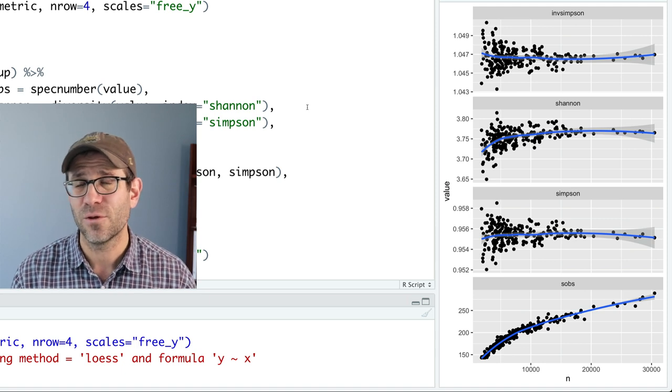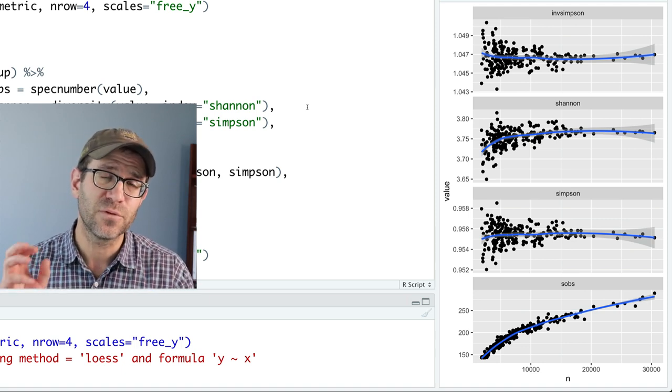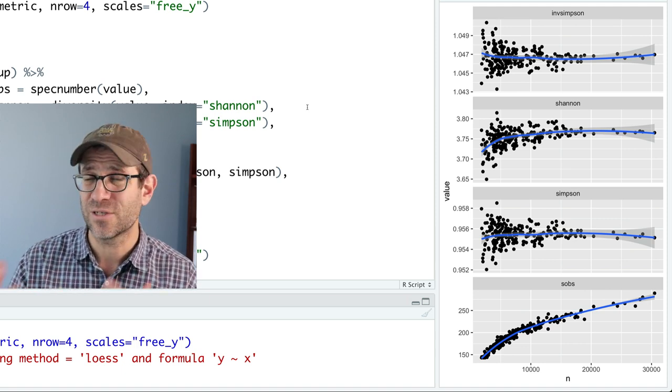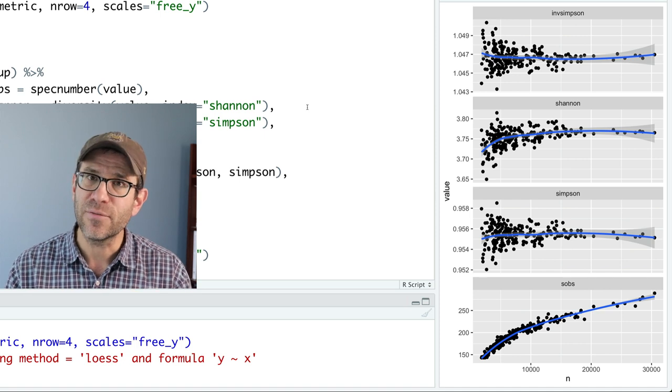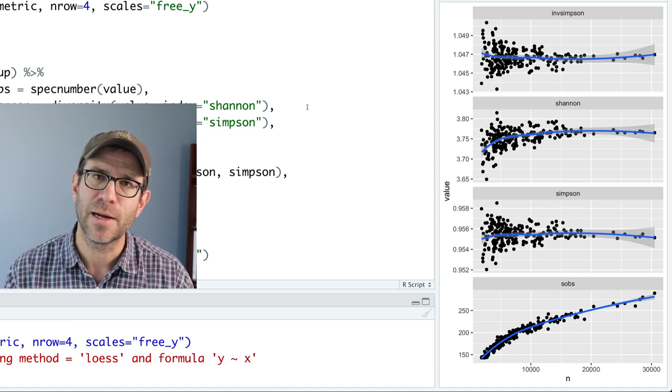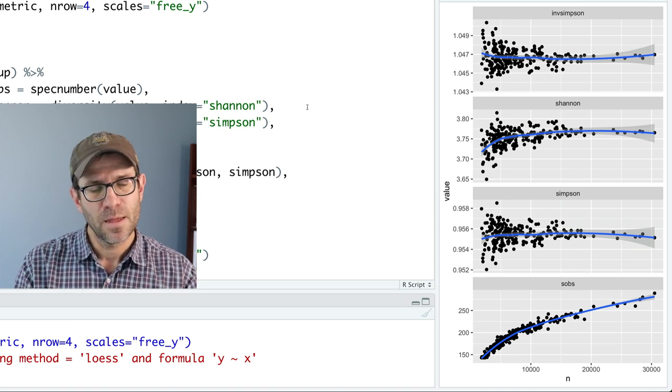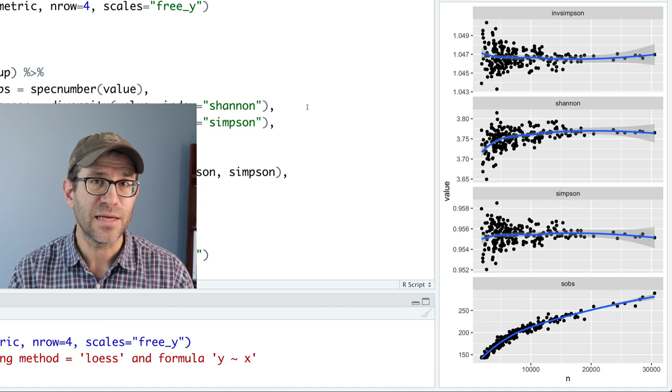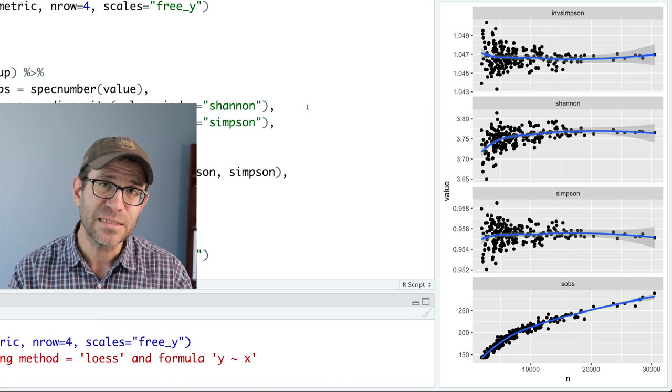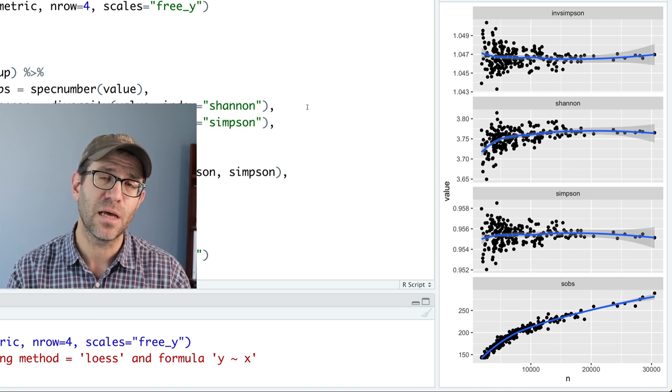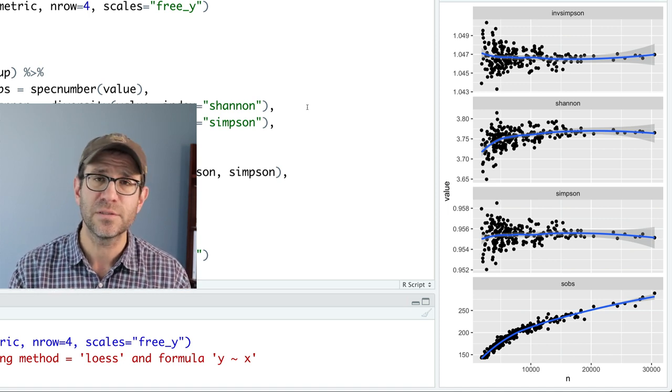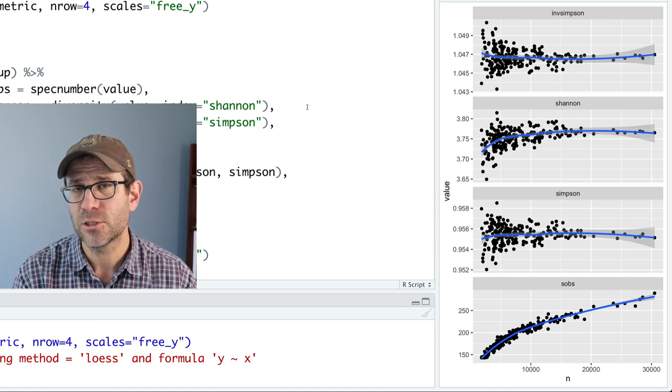The second thing I wanted to share with you was that for sure the observed number of OTUs or taxa, the richness, is definitely influenced by sampling effort. The Shannon diversity to a lesser extent but still has some influence of sampling effort on the Shannon diversity metric.